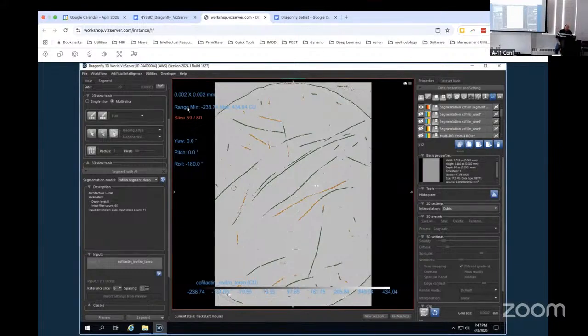But if you run into stuff that it doesn't work well on, there's no reason why you can't crop a piece out, concatenate it to our neural seg data, retrain the network, and just have your own version of it.